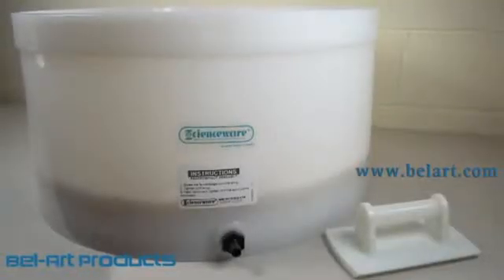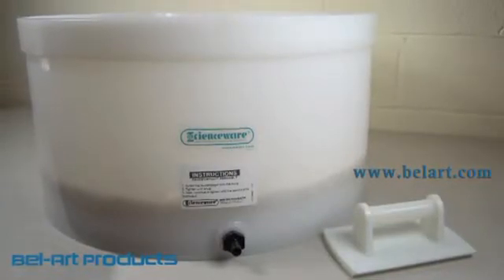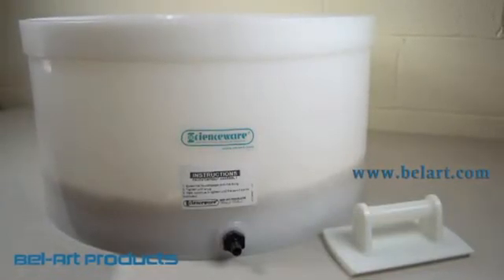The Scienceware Buechner Funnel Trowel is the perfect tool for smoothing cracks in your cake. Contact your Bellart distributor or visit bellart.com.